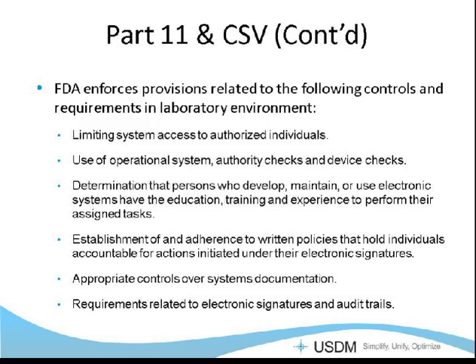FDA enforces provisions related to the following controls and requirements in the laboratory. Limiting system access to authorized individuals. That can sometimes be a huge issue. A lot of laboratories that I see still use group logins for certain teams. And it's because people need to use a computer system.